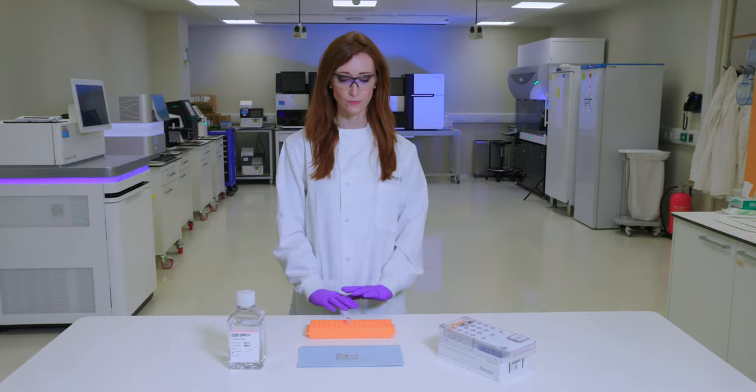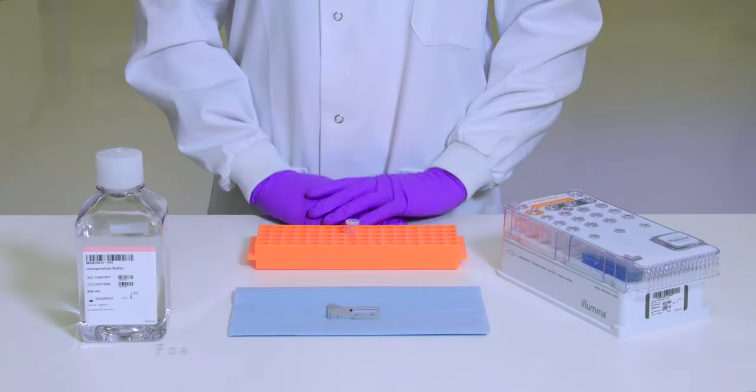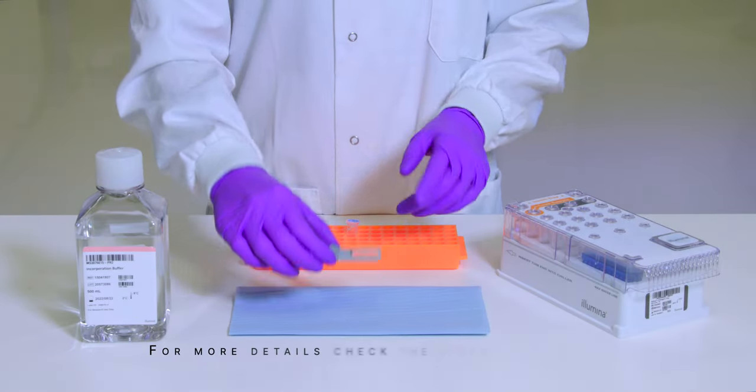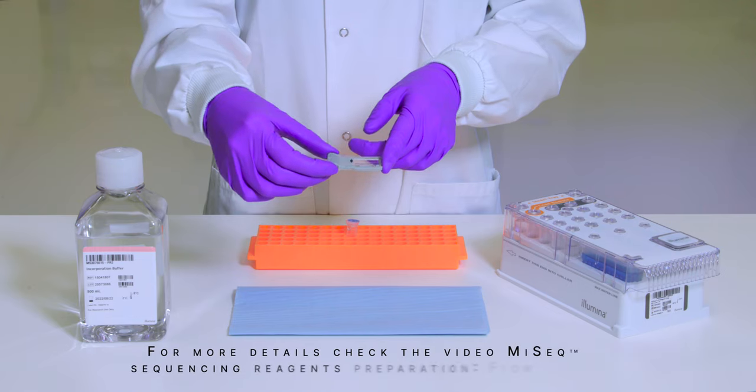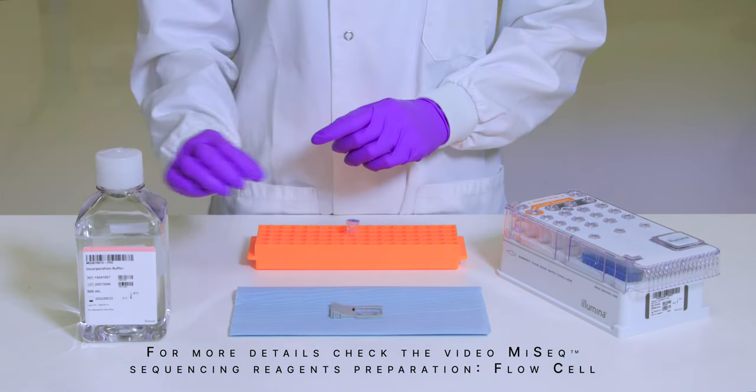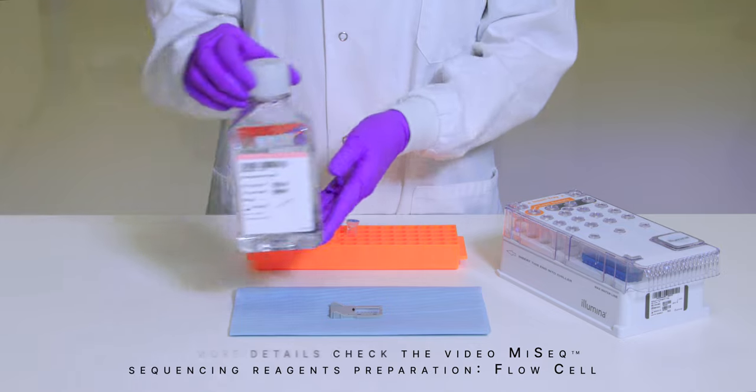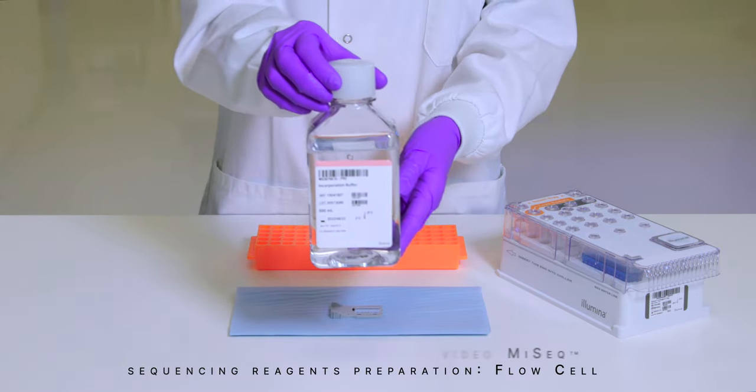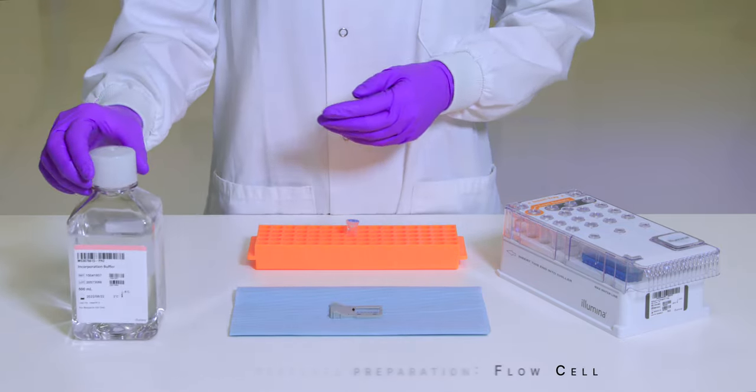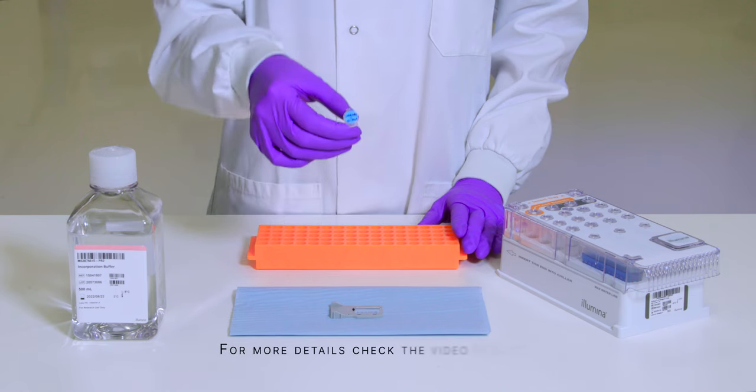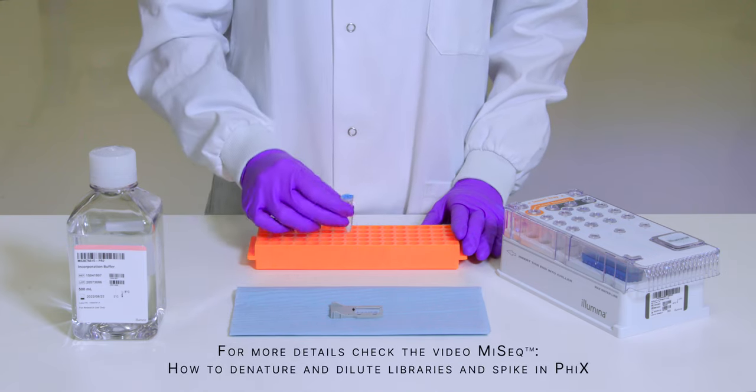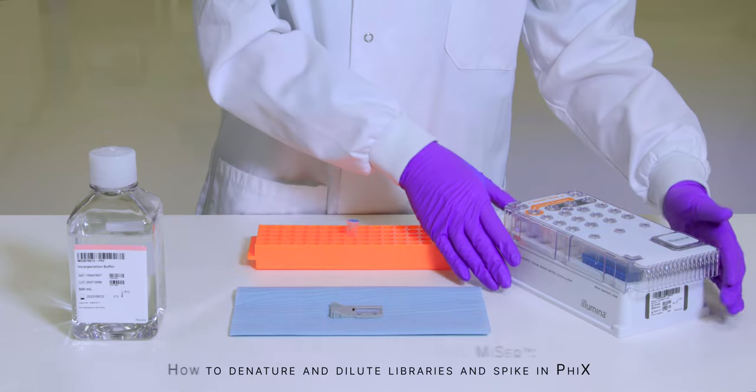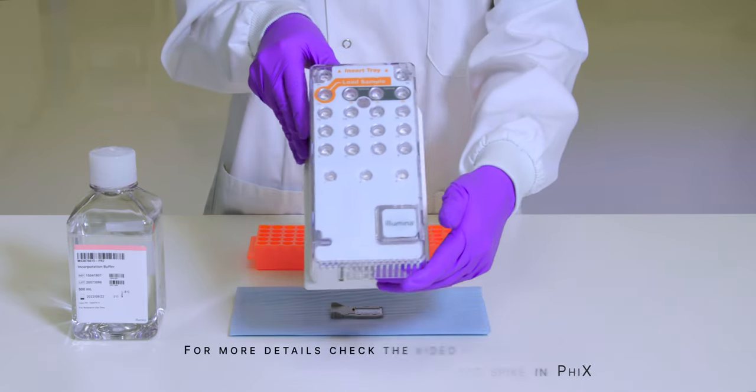In order to start a MySeq run you will need a clean MySeq flow cell, the MySeq PR2 bottle, a denatured and diluted library, and a fully thawed MySeq reagent cartridge.